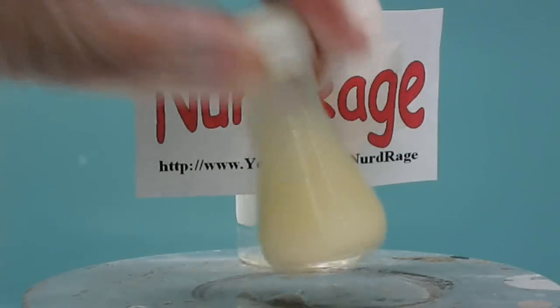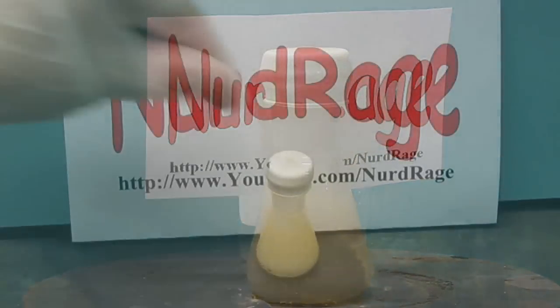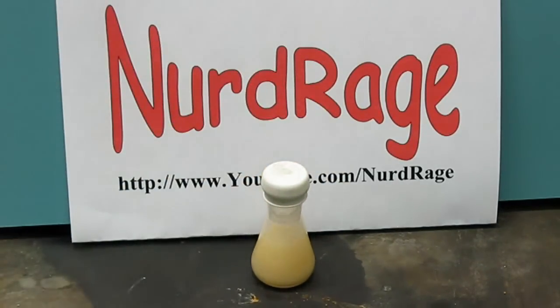It doesn't seem to be fully mixed here so give it a good shake. Let it warm back to room temperature on its own. The mixture is ready and the first thing we need to do is filter off the unreacted chemicals.